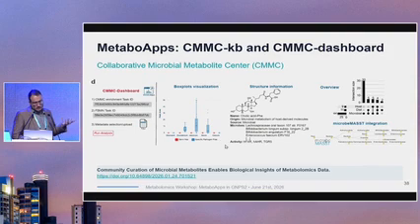You're going to visualize the box plot as we've seen before based on the type of information you provided. And then, as I mentioned, the curation of all this microbial information is going to be highlighted on the structure information for those annotations. So you're going to have at least the name, the origin, the type of source, the microbes that it's already been analyzed or detected or studied, and the type of activity information we have on that. And then finally, you're going to see an overview on that, so the visualization of that on your data.